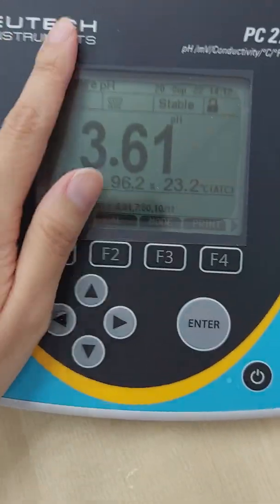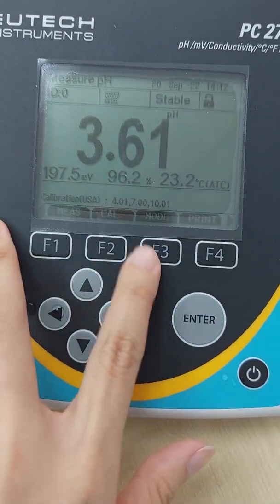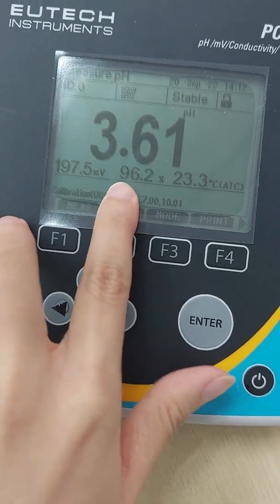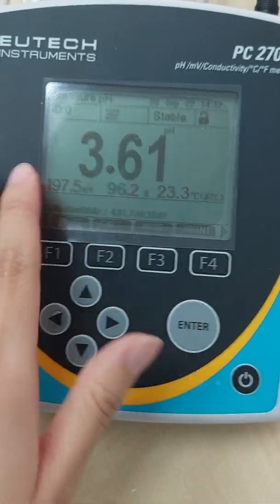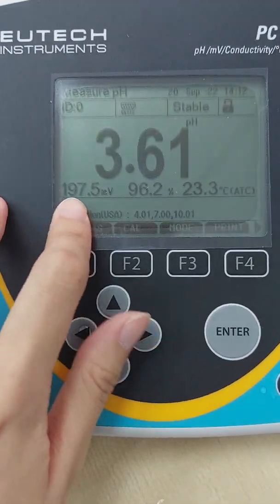Now look at the meter. Now we are at pH mode. Earlier we have done the calibration, so the slope will be shown here, and then this is the temperature, and this is the millivolt.